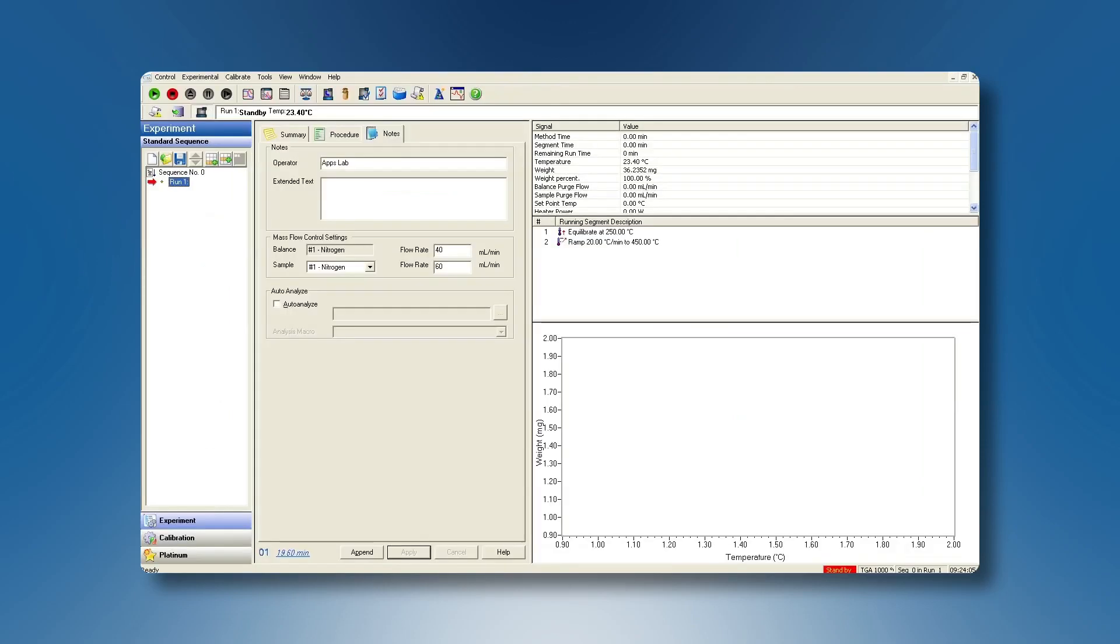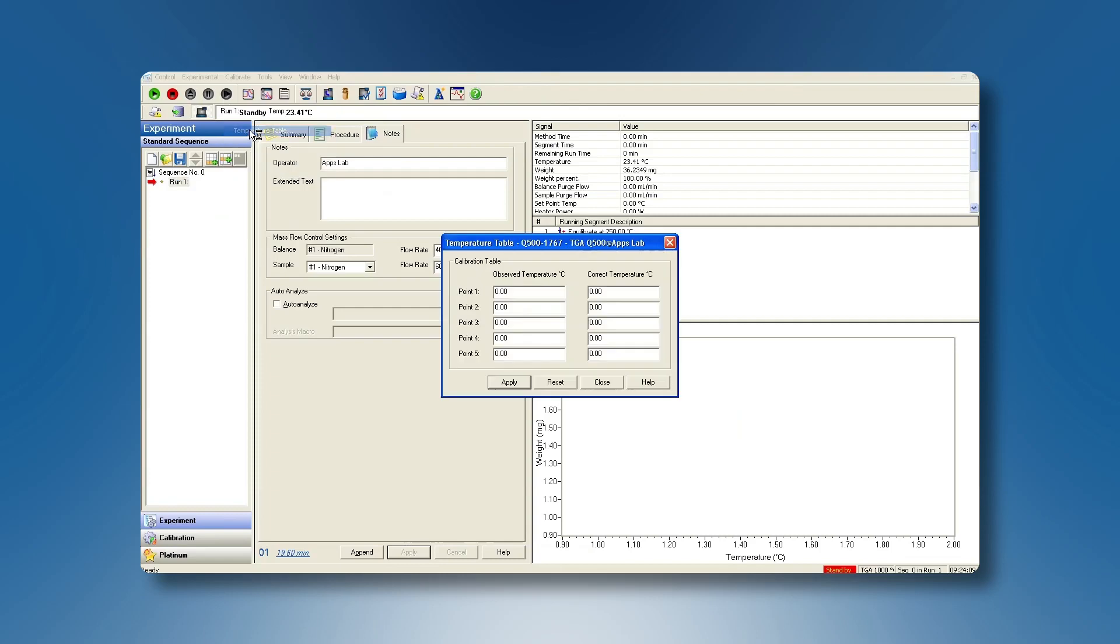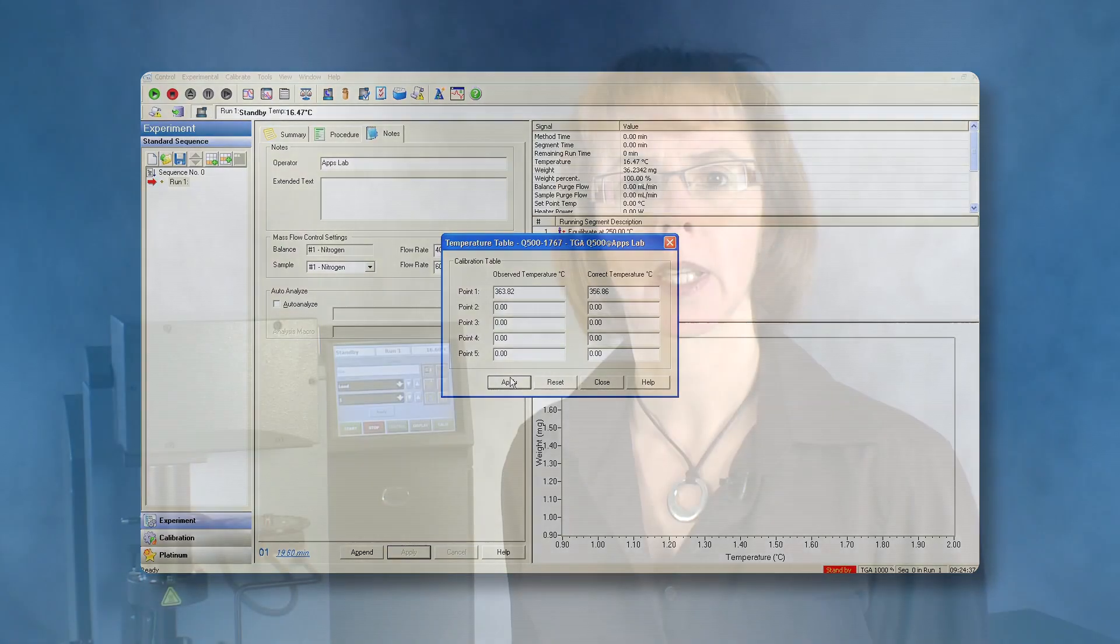Now access again the temperature table. Type in the measured value as observed Curie temperature. Type in the theoretical value as correct Curie temperature. Apply these changes. From now on the instrument will apply this temperature correction to the collected data.